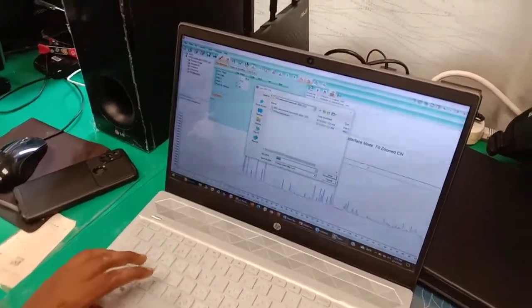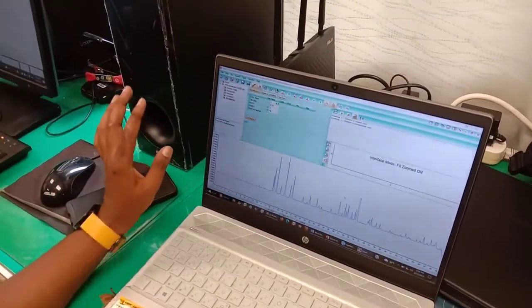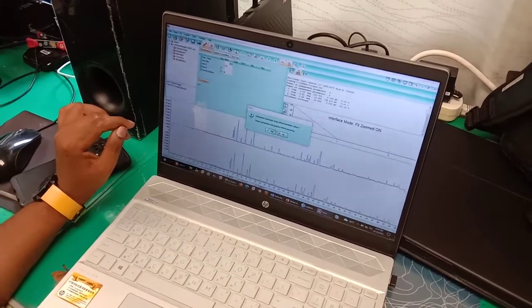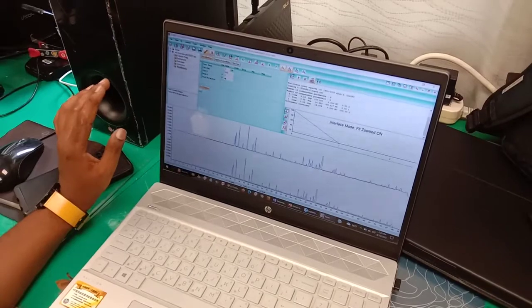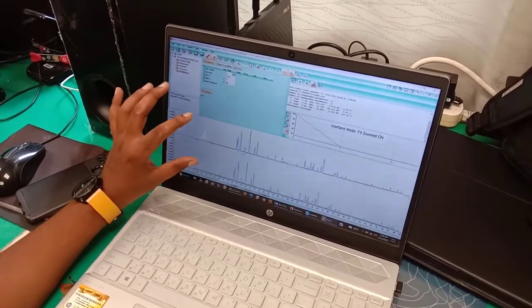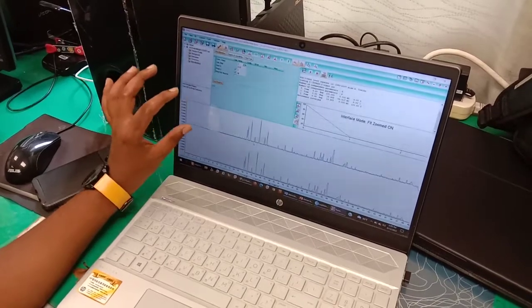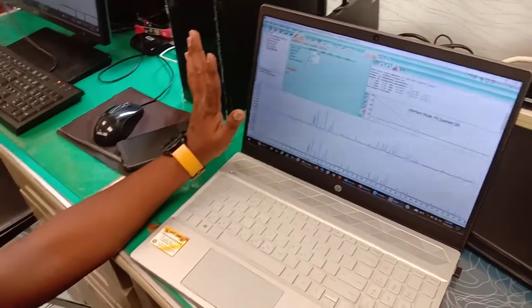Then you save the file. Okay, you always save the file. So you save the file and just make a simple run. Okay, now we can see we have started the refinement. So now we have set the software with the condition we actually measured. Now we have to give some initial guess to the software, because Rietveld refinement is based on iteration principles.